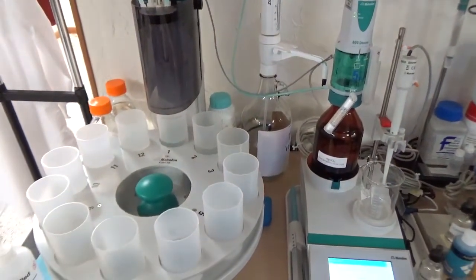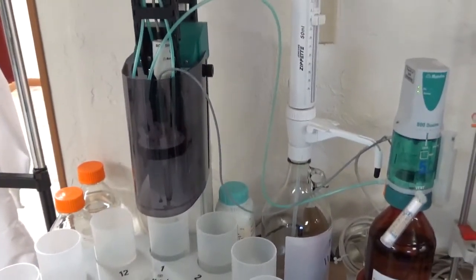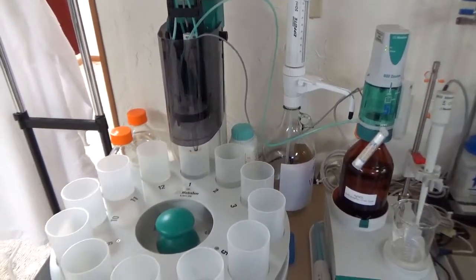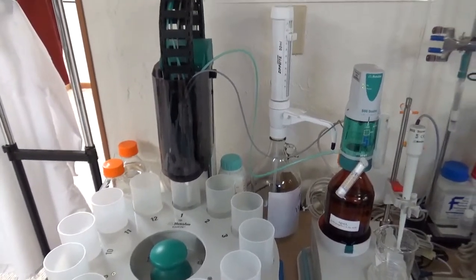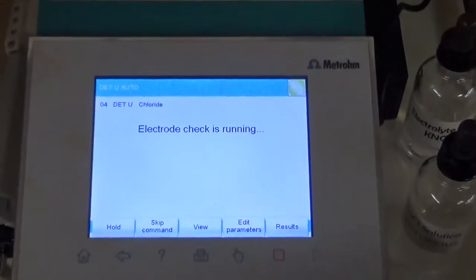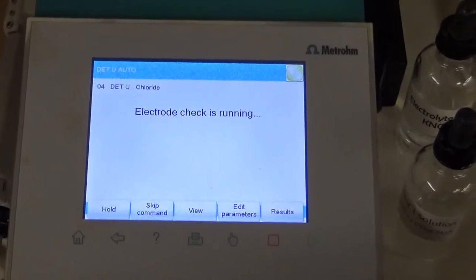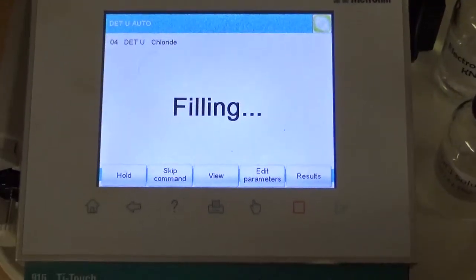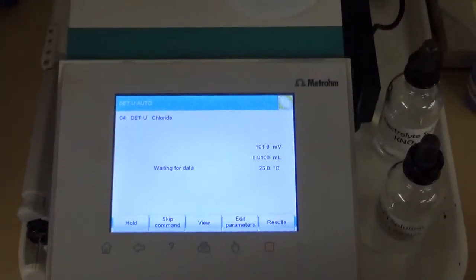You can also do a single-sample titration if you don't have multiple samples — just put the sample in a beaker, use the stirrer, and start. The plot starts showing millivolt versus milliliters of silver nitrate added. After the entire 5 milliliters of silver nitrate is added, the burette refills and starts dosing again. The 5 milliliter cylinder inside contains a piston that doses incremental amounts of 0.2 milliliters per increment. Very precise dosing — as the equivalence point approaches, titration slows down.